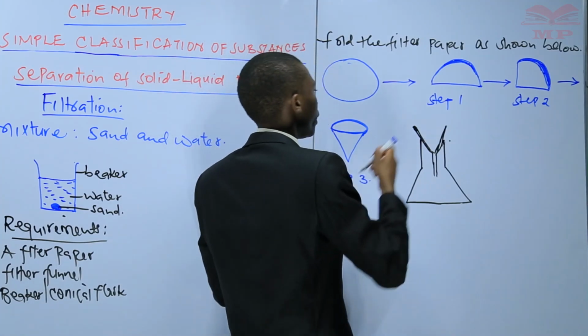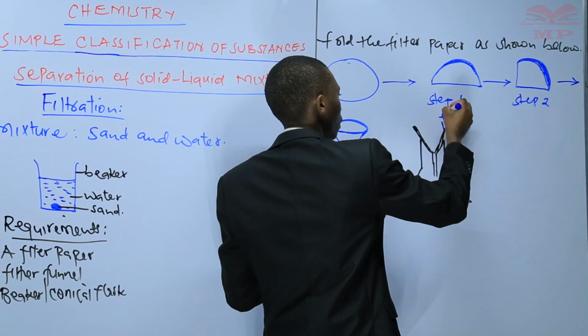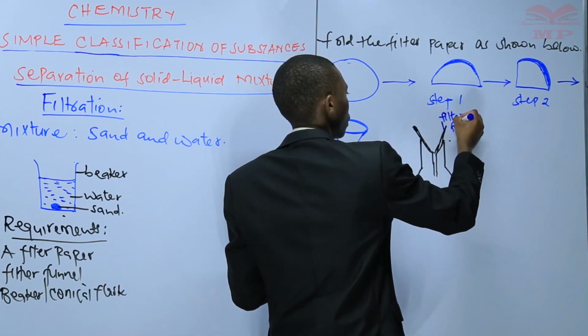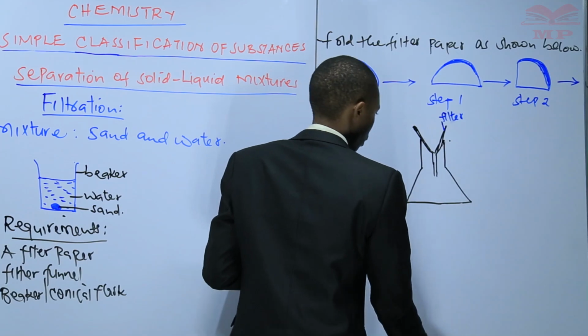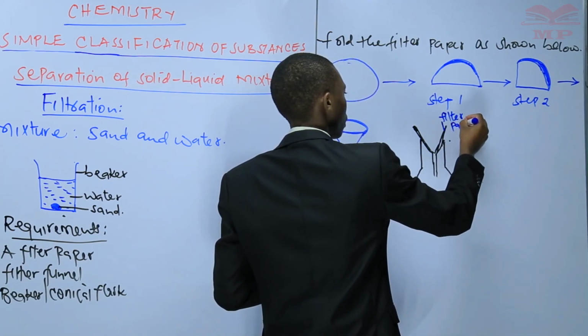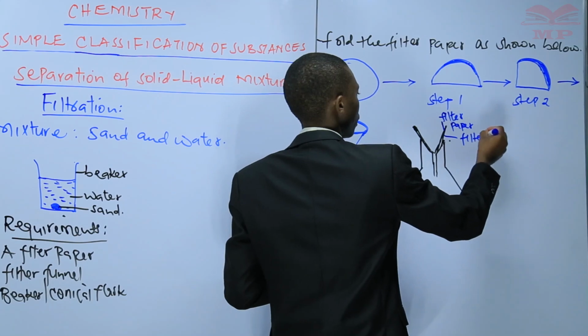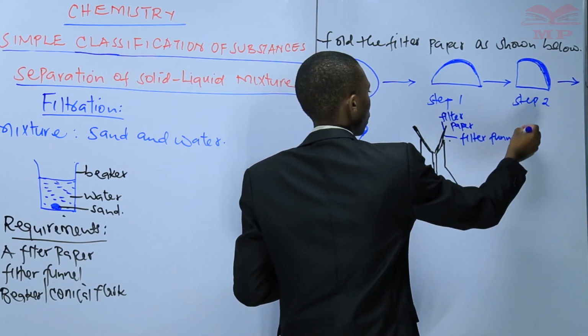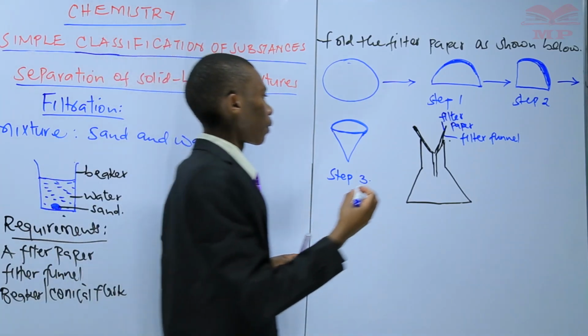Here we have the filter funnel. It's the filter paper. And this is the filter funnel. So we have the filter paper and the filter funnel.